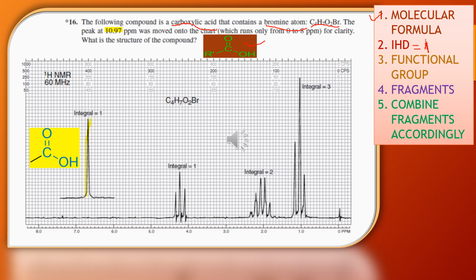Usually this peak is not found, but I will discuss the reason in another lecture video. So you can see this peak is showing that a carboxylic group is present, and it is also mentioned in the question.